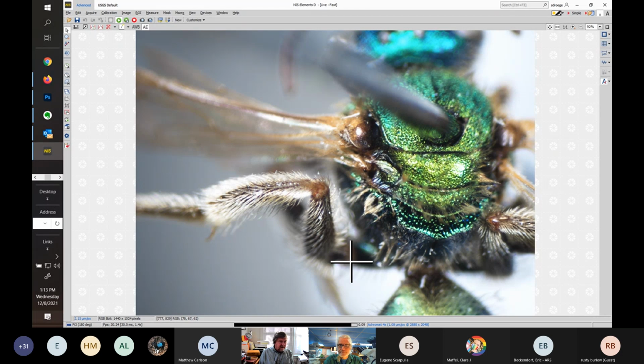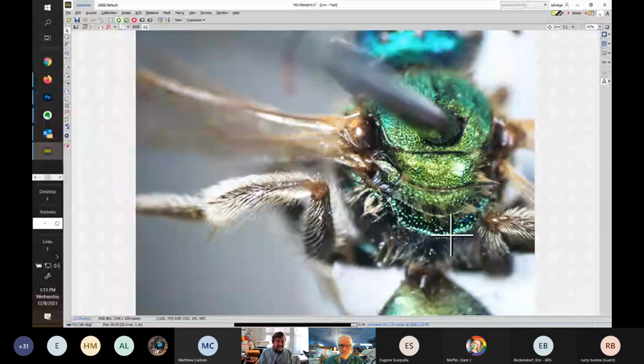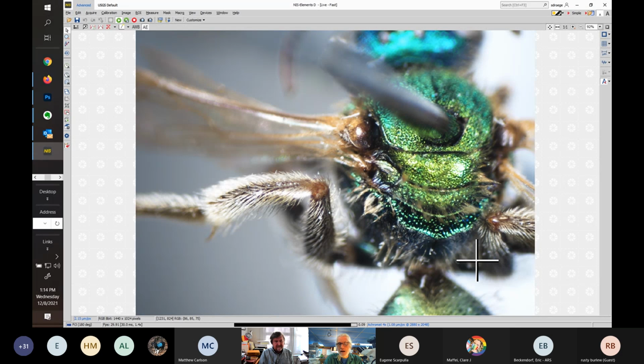I mean, at least what I'm seeing is subcarinate all the way along the dorsal margin, nothing rounded, and very striate. So that, to me, is one of the extremes. Right. And if we were further south in Florida, we might say, oh, that's probably gratiosa, but this was from Maryland. Right. So it could be that gratiosa is in Maryland, but there's the other material, males and whatnot, and just the confusion as to what gratiosa is, because aurata also co-occurs, at least in terms of what the specimen looks and feels like, with gratiosa.